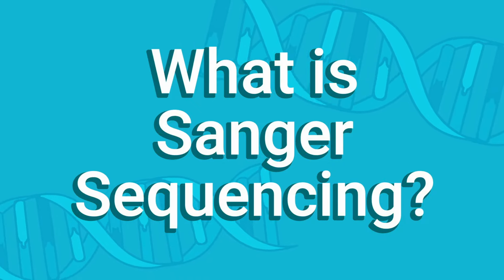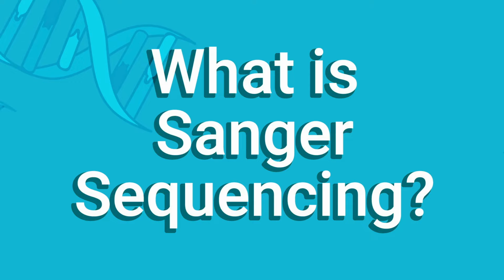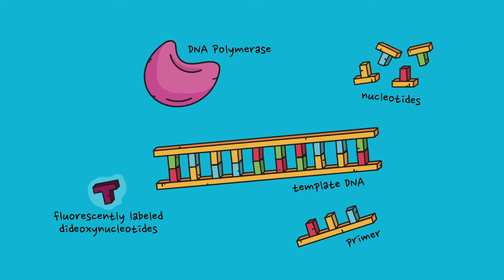Sanger sequencing has been the foundation and gold standard of DNA sequencing since 1977. While new sequencing technologies have emerged since, Sanger is still an invaluable tool for all kinds of labs. The basic steps of Sanger sequencing are simple.